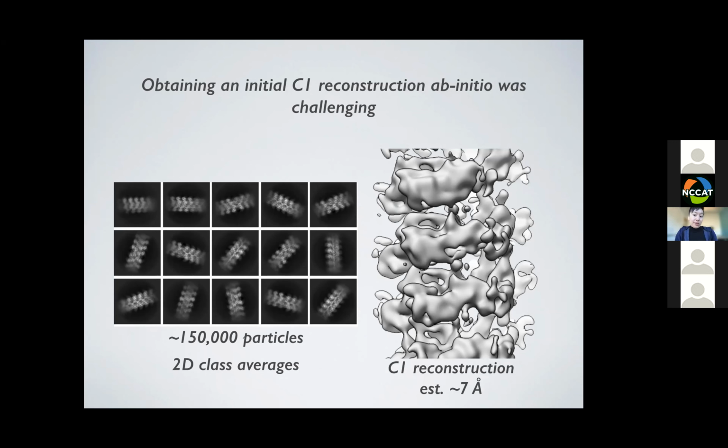The reason we knew it was a helical filament was that we employed some helical analysis that I learned from my time in the Nogales lab, which is called layer line analysis.